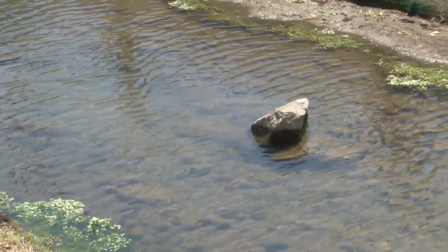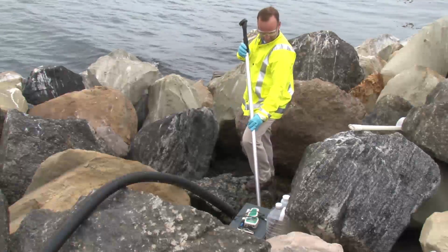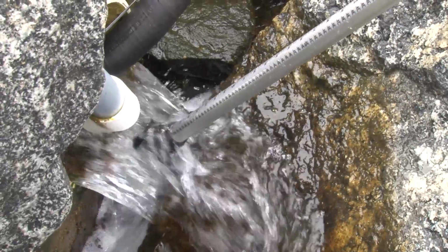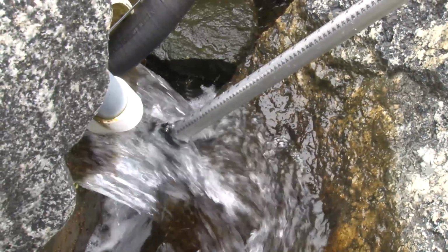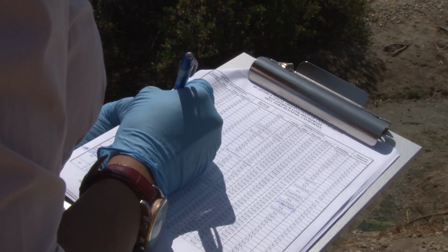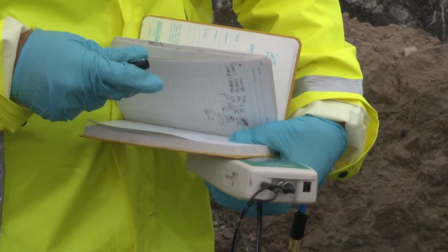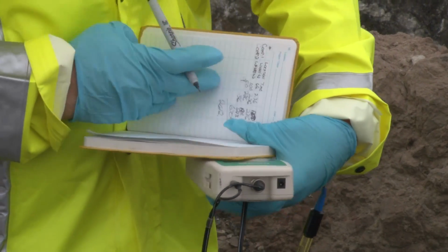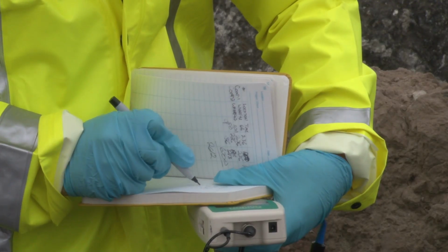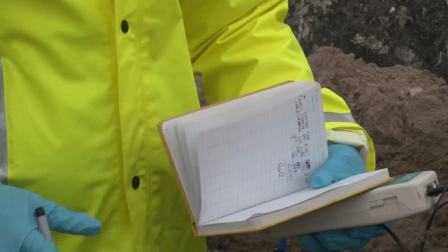For flow proportional sampling, the stream flow will also have to be checked at 20-minute intervals throughout the sample collection process. In addition, carefully record the rainfall data prior to and during sampling. Good record keeping is very important. Include a waterproof logbook in the sampling kit to record rainfall data, including daily rainfall totals and time and date that rainfall of 0.1 inches or more ends.